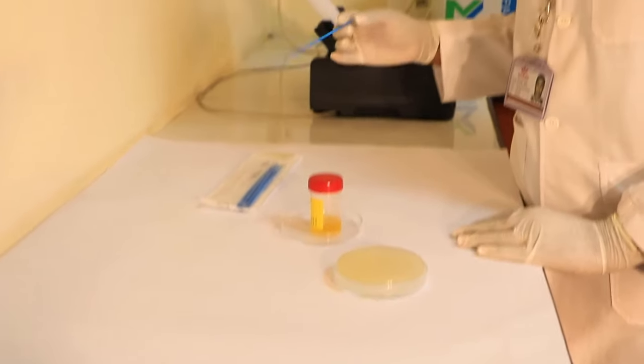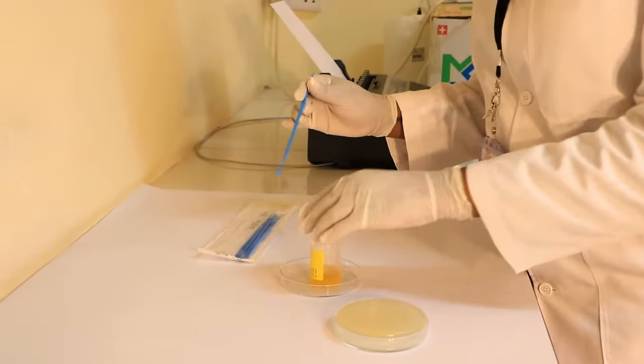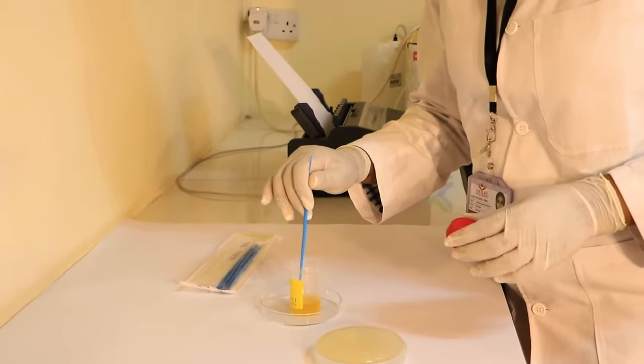To perform a urine colony count, take a sterile wire loop and pick one microliter of urine.